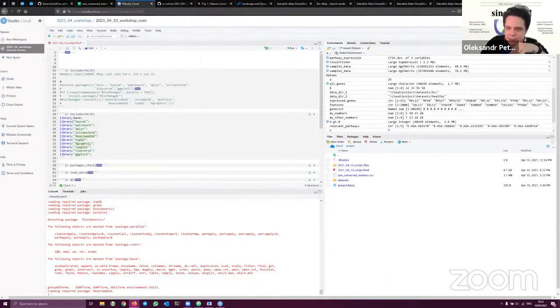Well, the only thing that works is the part that says plot cars, which is part of the notebook, like an example. I don't know if I'm writing it in the right place or not. If you just share the screen, we can take a look. It can be not very intuitive for new users, so it's better just to take a look. Yes, sure.